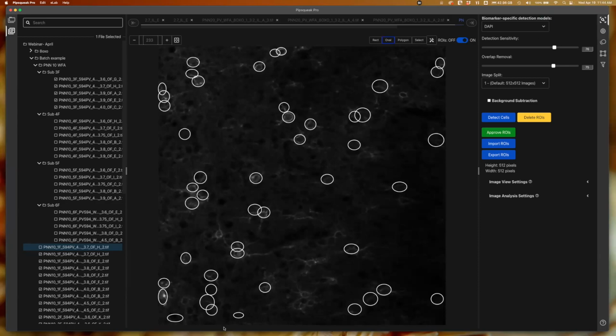Thank you. Yeah. So essentially what we're doing here is developing a training set of images that I'm going to apply to my model. So I would go through and make sure that I'm detecting exactly all the cells that I want. The trick to this is that I need to make sure that all of the detections I show our AI trainer are exactly what I'm looking for, because the mantra in AI is garbage in, garbage out. If you are showing it bad examples of what you're trying to find, it's going to reproduce that and probably give you sub-adequate results back.